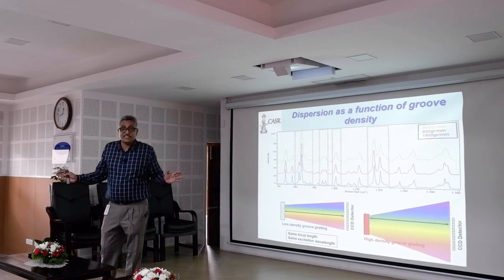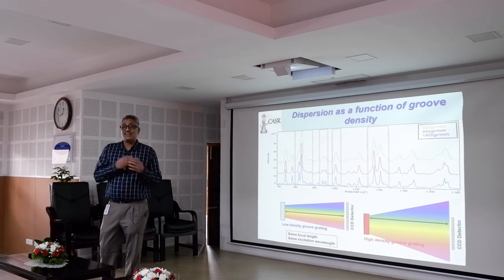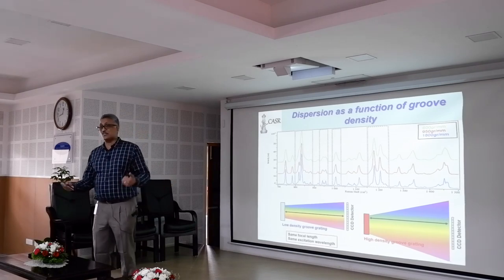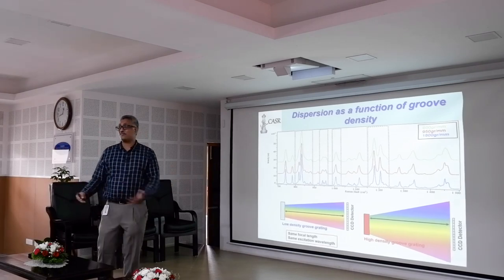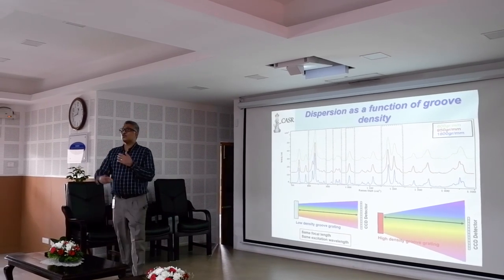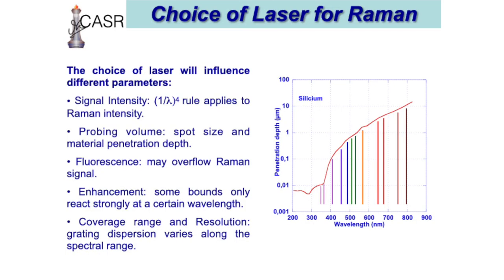So you are never limited. You can have the spectrometer, you can just change the grating, you can actually increase the resolution. You can change the wavelength, you can increase the resolution. You can increase the length of the spectrometer, you can increase the resolution. So there are multiple ways to do it. So you are never stuck with a particular problem. You can actually do that. So these are what it is.